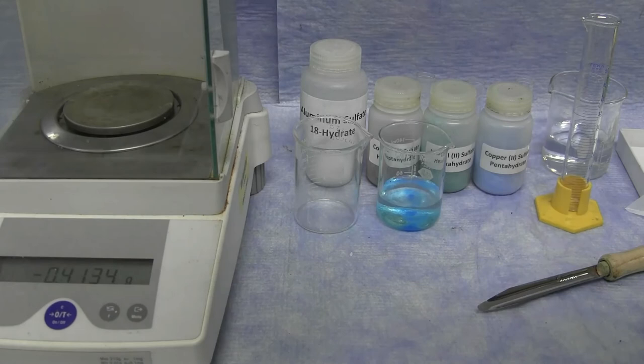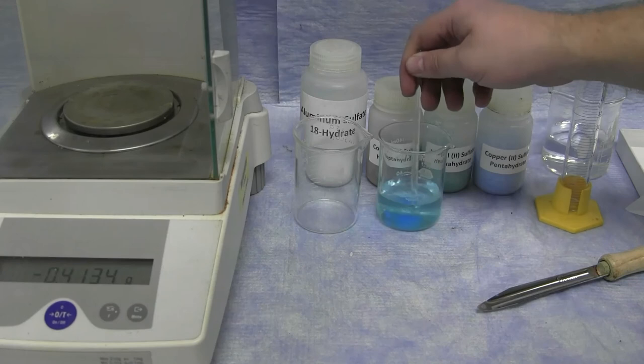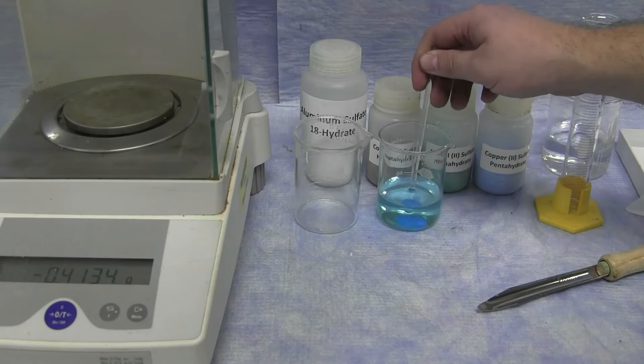Once the solid and the liquid are combined, you can use your stirring rod to mix the solution together. You want to mix the solution and wait until all of the solid material is dissolved.